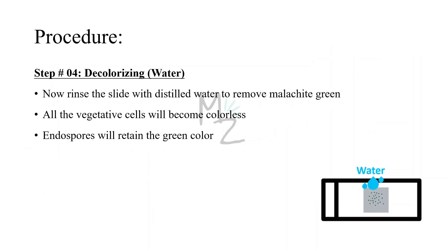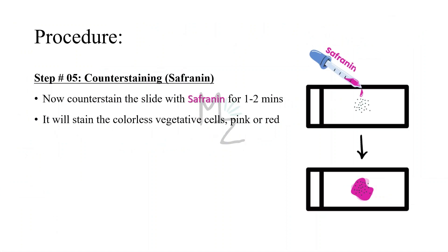Step four is decolorizing. We'll rinse the slide with distilled water to remove malachite green, since it is water soluble. All the vegetative cells will become colorless because they didn't retain the dye, but the endospores did — they are now green colored dots, as you can see. Step five is counter staining: we'll counter stain the slide with safranine for one to two minutes. It will stain all the colorless vegetative cells pink or red. Now endospores appear as green dots while vegetative cells appear pink.